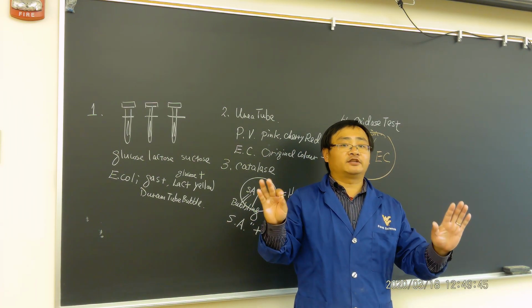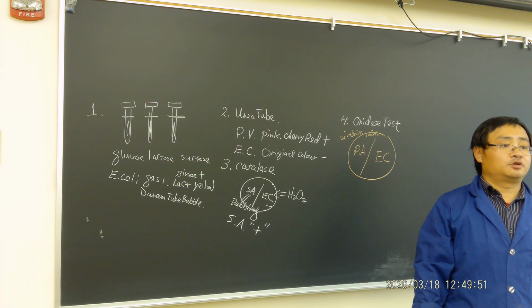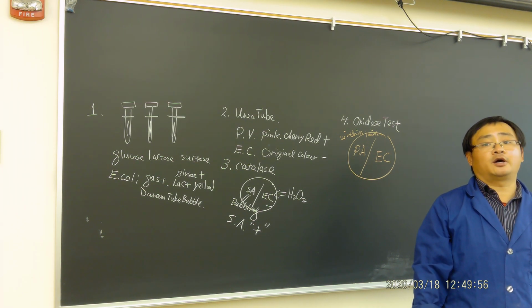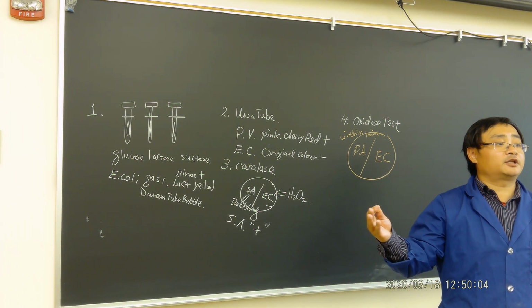You should see one side, very obvious, is purple. You guys can share one, okay? Is that good? Which one is purple? Is that Pseudomonas that is purple?